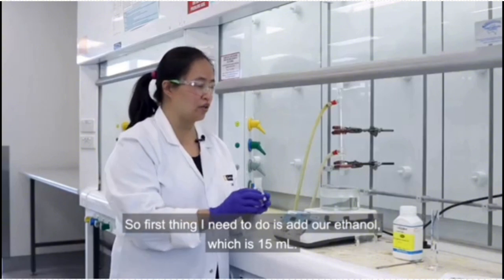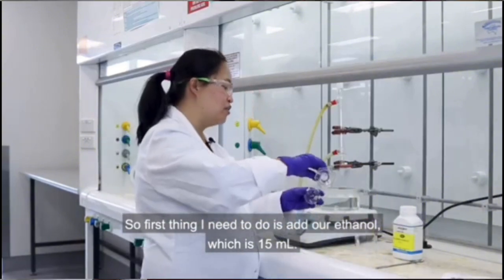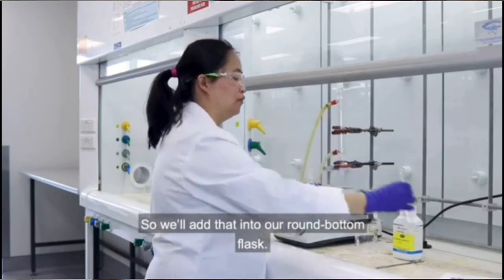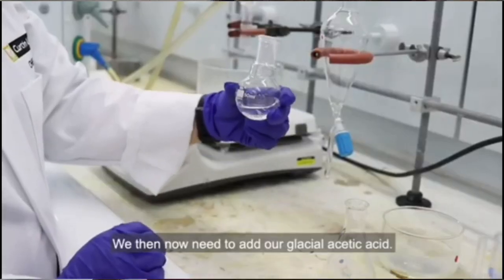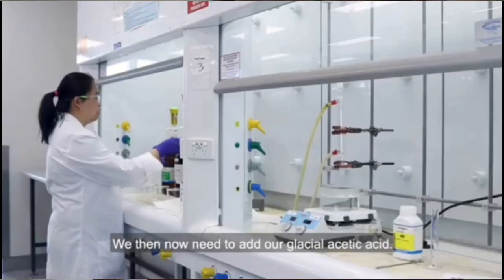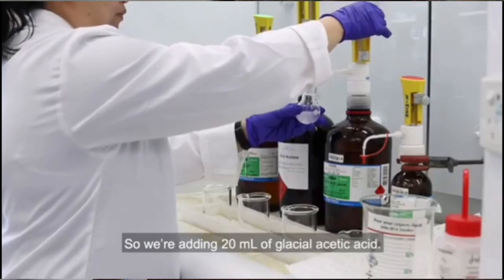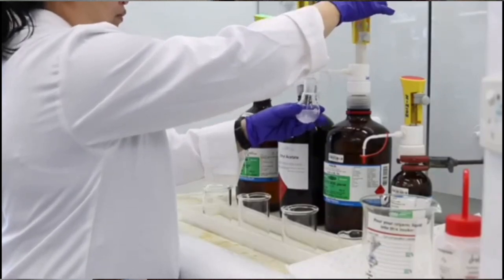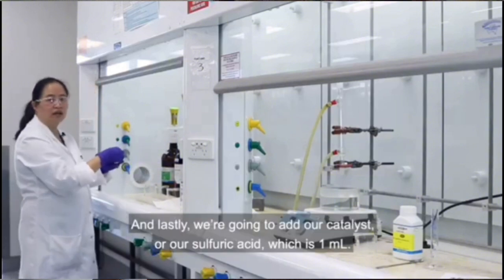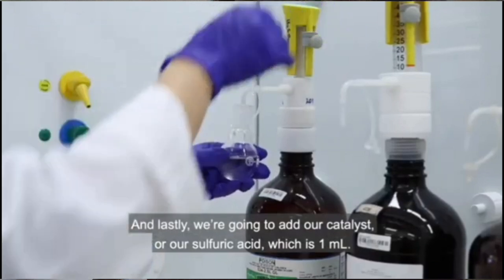So first thing I need to do is add our ethanol, which is 15 mils. So we add that into our round bottom flask. We then need to add our glacial acetic acid. So we're adding 20 mils of glacial acetic acid. And lastly, we're going to add our catalyst, our sulfuric acid, which is 1 mil.